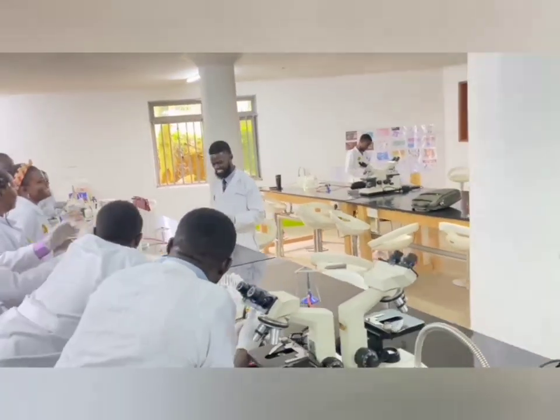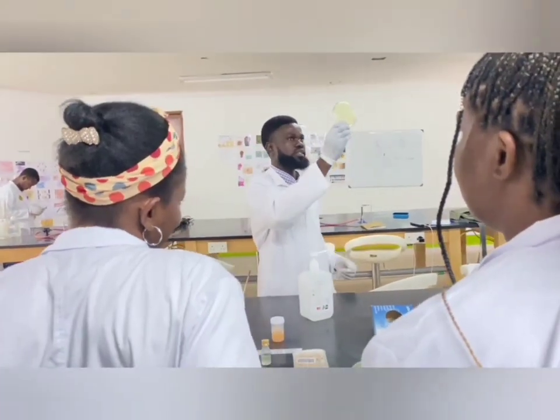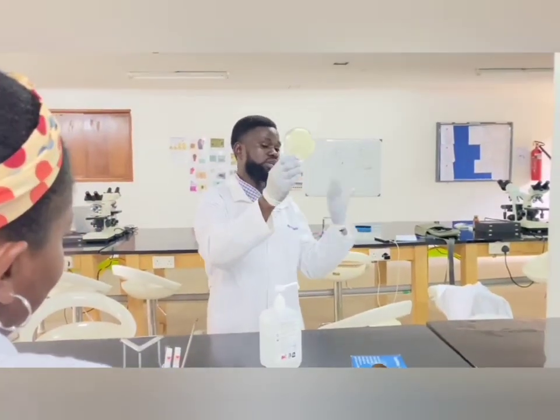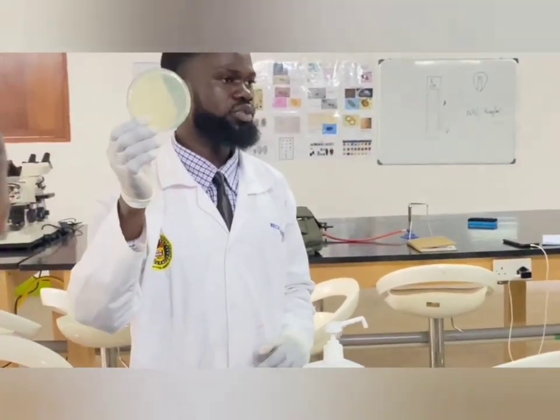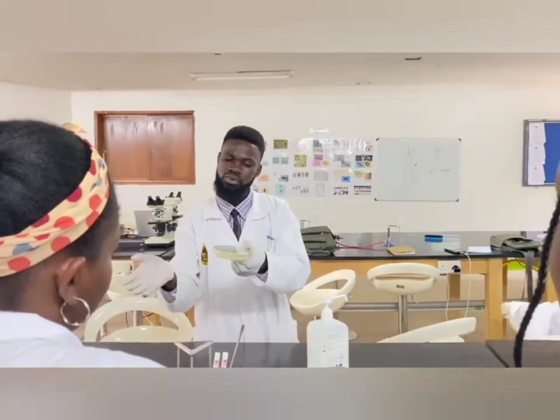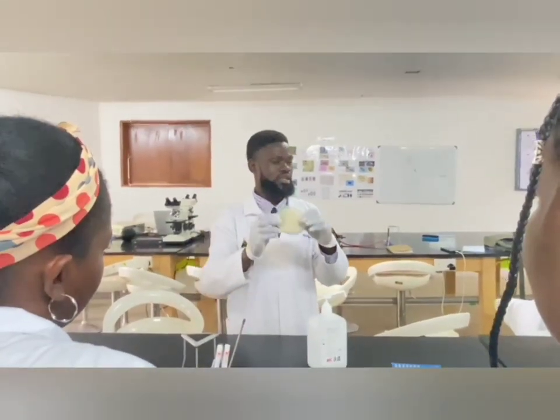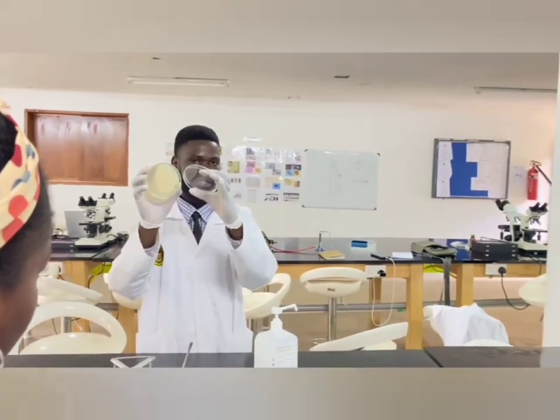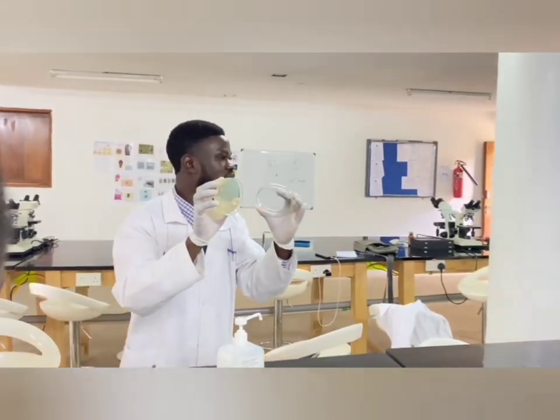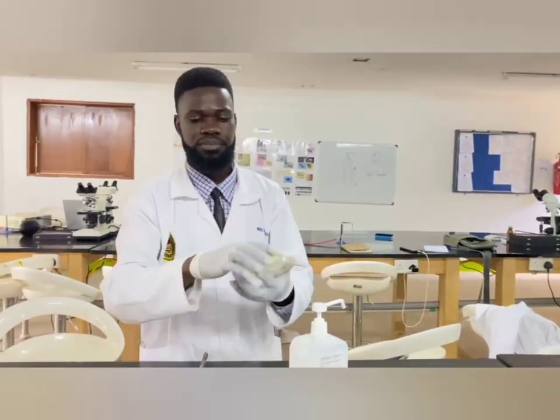Yes, from our body. So this plate, you can see, is transparent. It can help us see whether our bacteria is resistant or not. This is the plate we are going to use to spread. The technique of inoculating our bacterium on this plate is called the surface spread technique. You have to spread the bacterium all over the surface of the plate before placing the antibiotic discs. Are we together? Before placing the antibiotic discs.